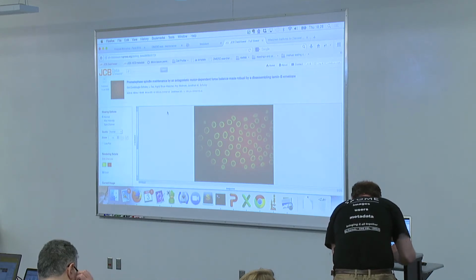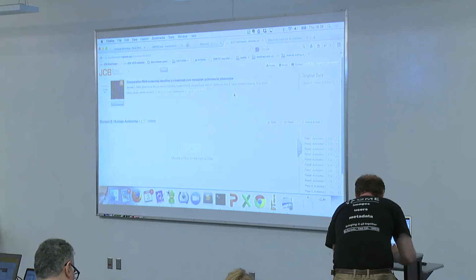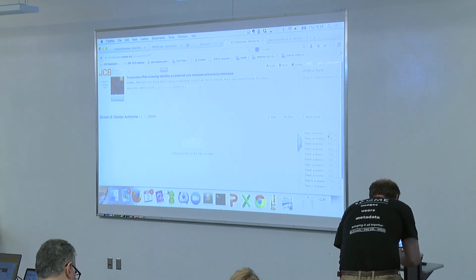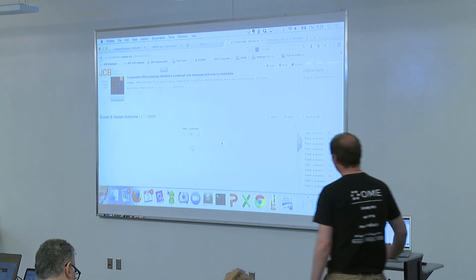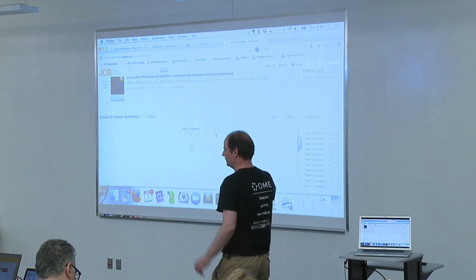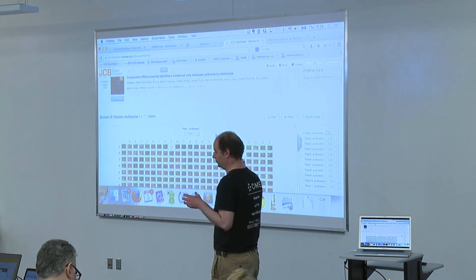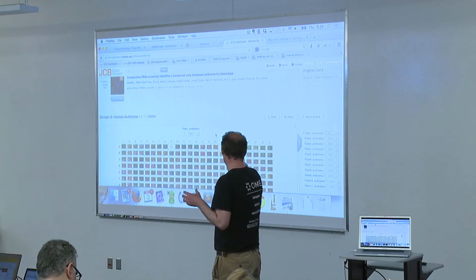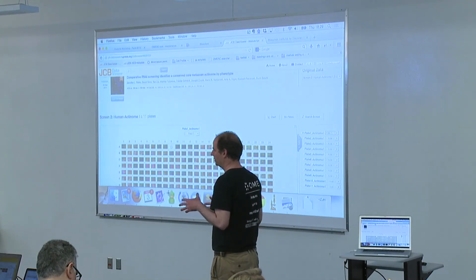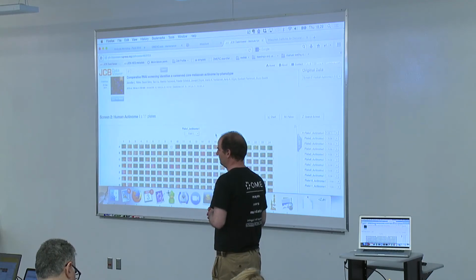Right, so this is one example of the JCB Data Viewer, and it's not the best. But let me go to the metadata. Right, so the JCB Data Viewer looks more or less like this. You've got sophisticated connections between the vast metadata the HCS people are producing in a graphical form, and between the points in the graphs and the particular wells from which the points were taken. So the data are big, but they are also heterogeneous. That's all what OMERO is about.